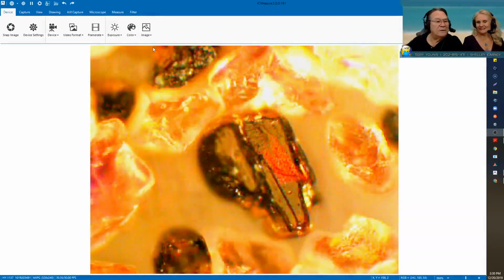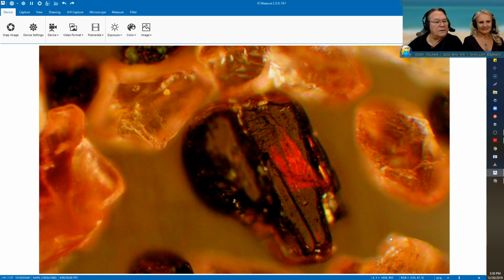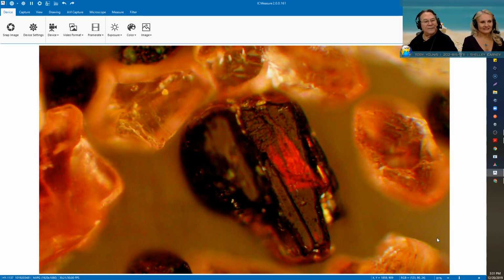Hang on. Let me turn on the light, the polarizing light, and let me turn on the microscope right there, and let me see it. I need to make it 1920 by 1080, so it's high resolution. There we go. Yeah. So this is that piece that I was telling you about.